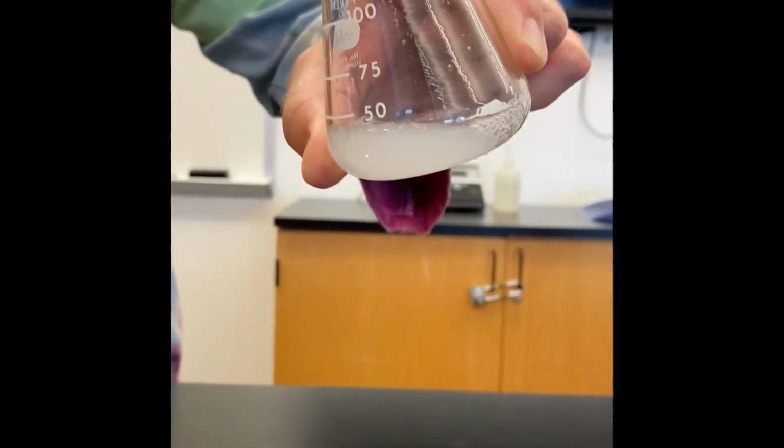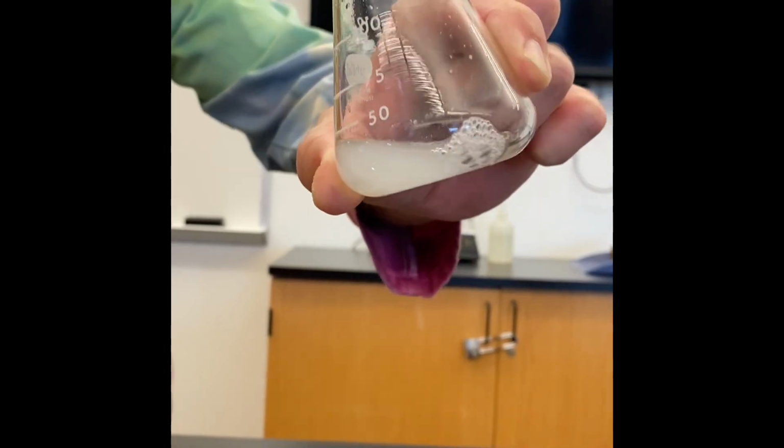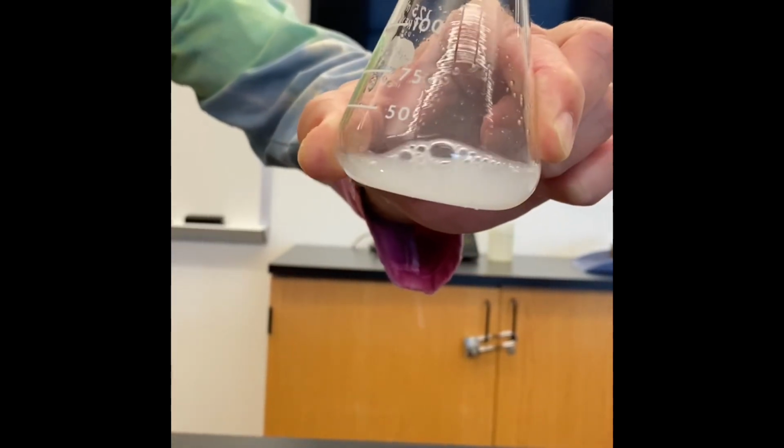And you should clearly be able to see there is a change in the lime water. The lime water has turned cloudy.